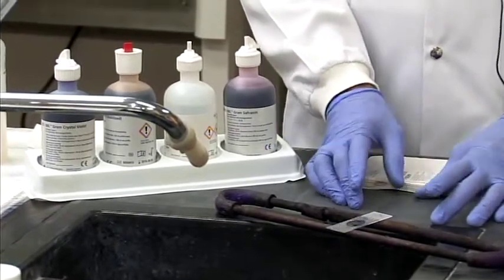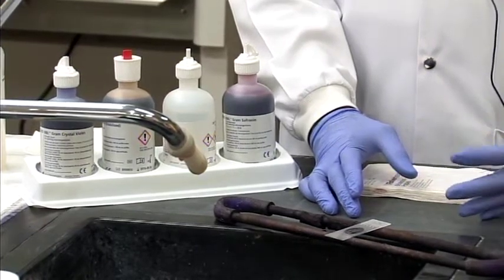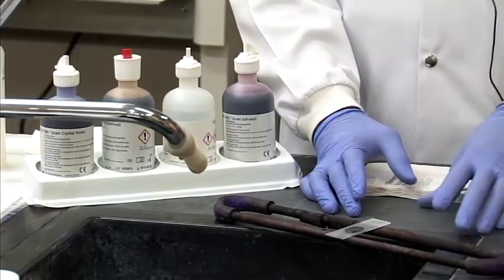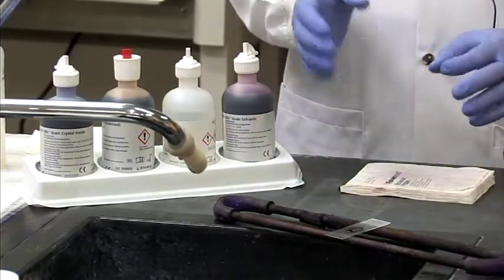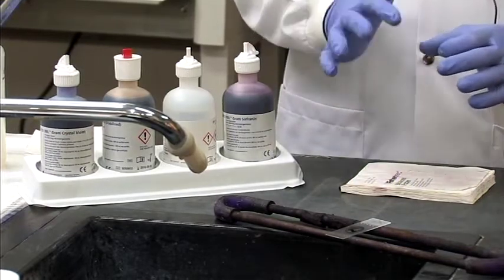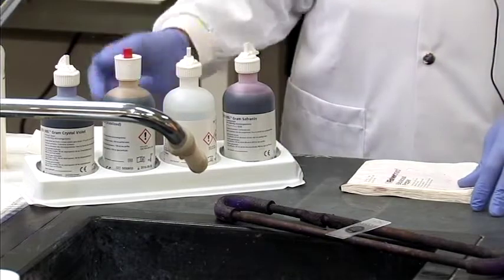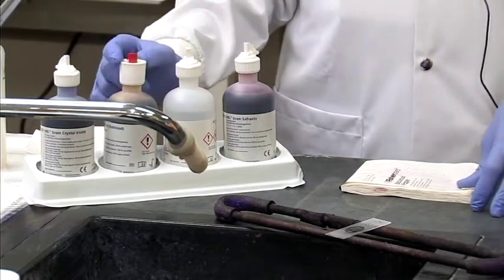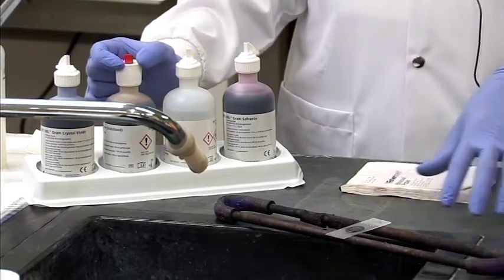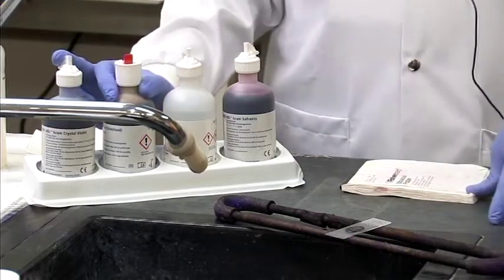So in the slide, we have placed 2 types of bacteria. So I want you all now, using the principle of the gram stain, to think about what happens at the cellular level as the stain is reacted. So we have 2 groups of bacteria, gram positive and gram negative. At this stage, both types of cells, gram positive and gram negative, will take up the purple bluish color of the crystal violet. After a minute, we will move on to your iodine. The purpose of the iodine is that it acts as what we call a mordant or stain enhancer that enhances the color of your crystal violet. It actually forms a complex with your crystal violet within the cell wall of your bacteria.